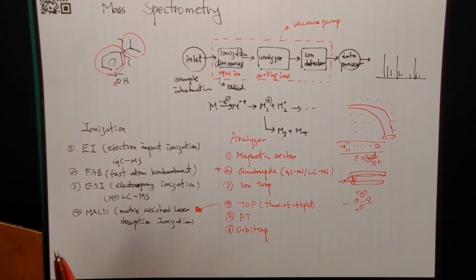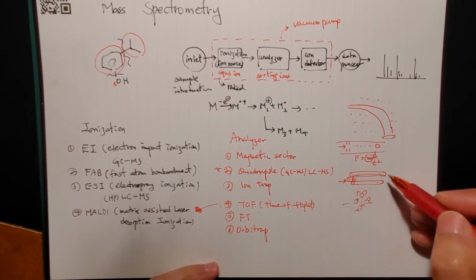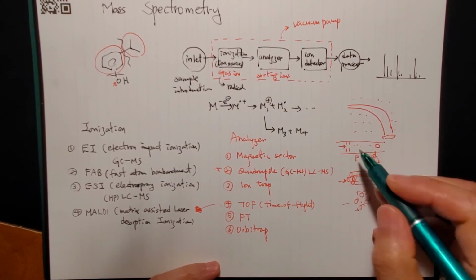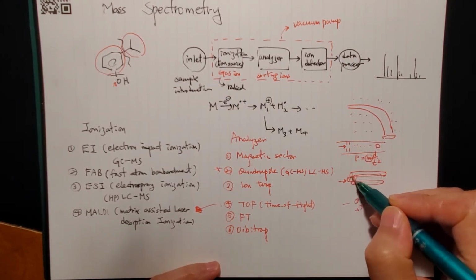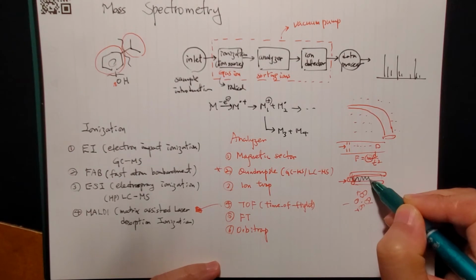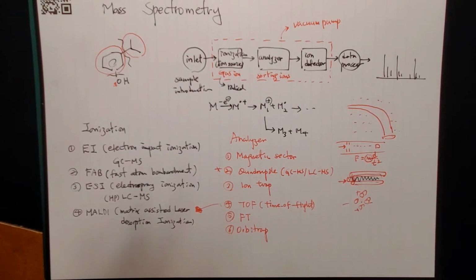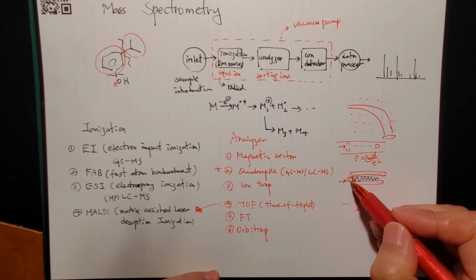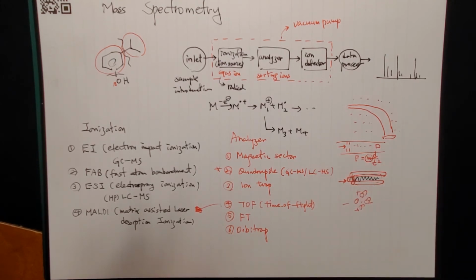When the particles are also charged, as you change the charge on those 4 rods, you can make the ions in the chamber oscillate. Pulled, pushed, oscillate, depending on their mass, right? The heavy ones will oscillate less.